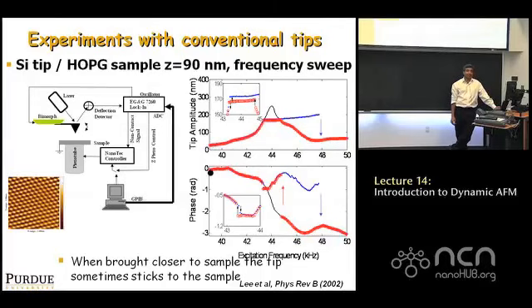This is not the simple frequency shift that we talked about. It's very complicated behavior. There are jumps happening, all kinds of things. The phase behaves in an interesting manner; it jumps up and down. So my point is that in reality, when you do experiments, the effect of the tip-sample interaction force is much more than the simple change in resonance frequency that we talked about.